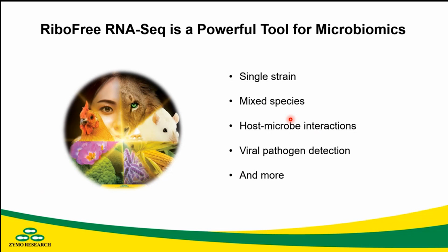Doctor, we have some questions in the chat from Luis. Luis says, how can these ribo-free libraries be preserved or stored in case we want to send some libraries abroad? Of course, is there an alternative from Zymo?